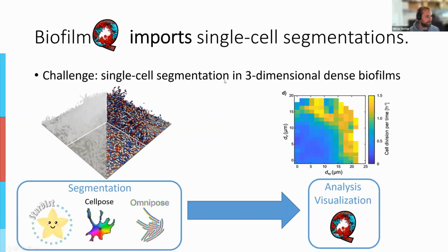This is single-cell segmentation in three-dimensional dense biofilms. So we have very packed, dense biofilms, as you might also see here in this image. And we want to segment each single cell here.